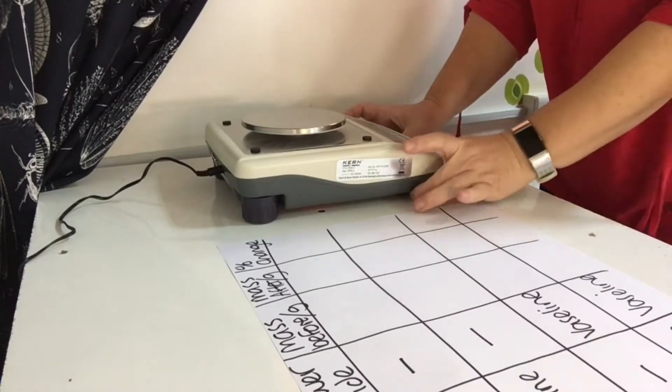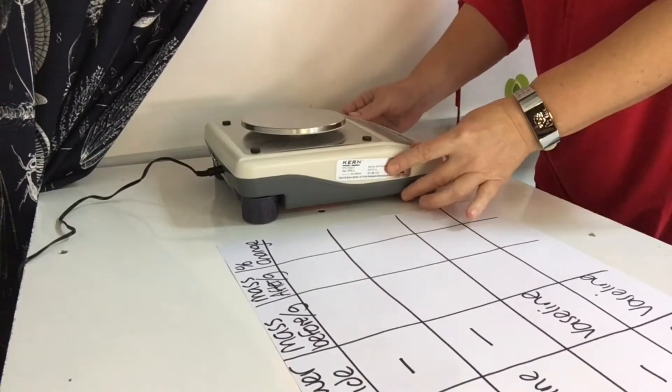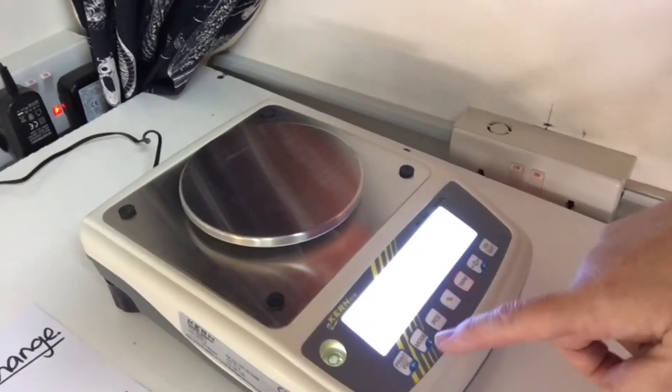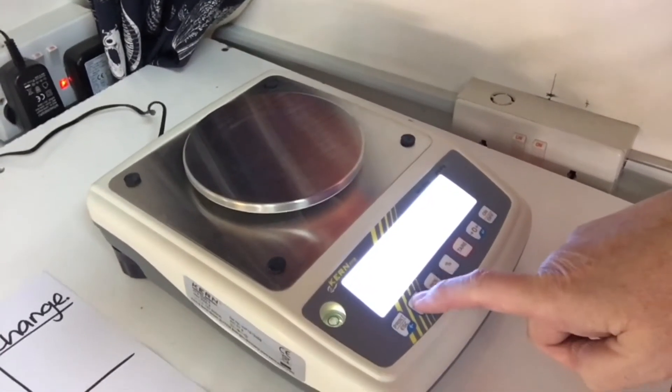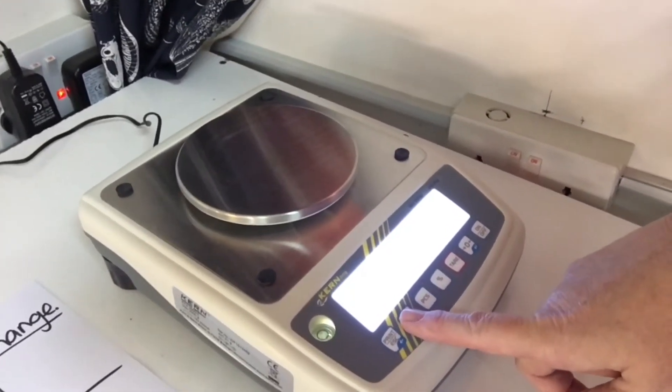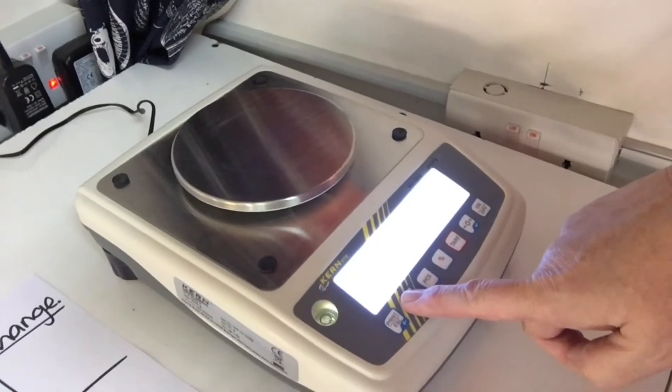I'm stabilizing my electronic balance now and making sure it's on the correct mode. You can measure things in grams but also in ounces and pounds. Here I'm pressing the mode button until I get it onto grams.